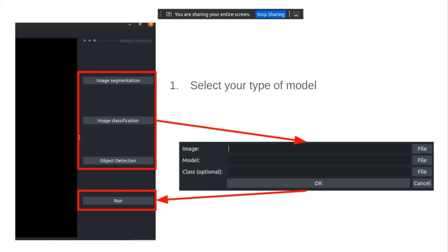You can install it in two ways. The second way is pip install, where you go to your terminal and write 'pip install Manini' and run this command.